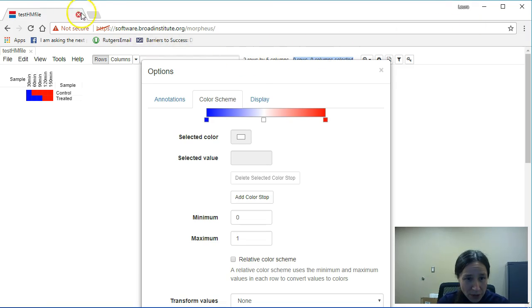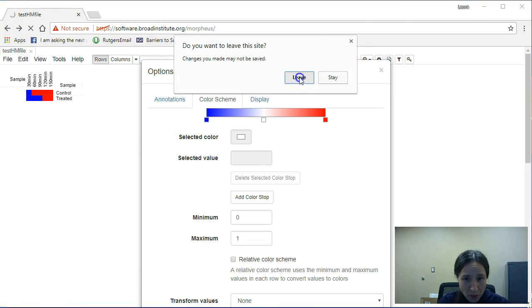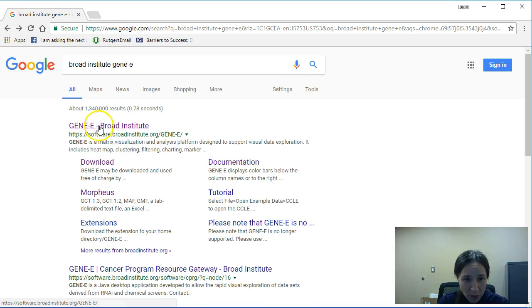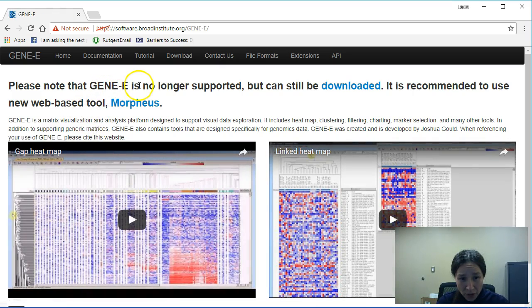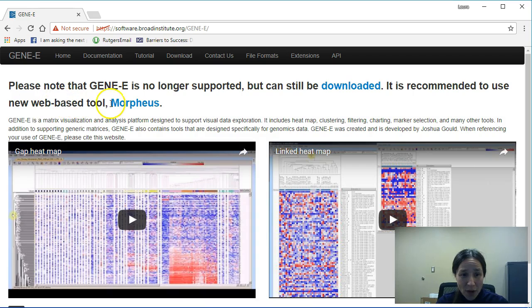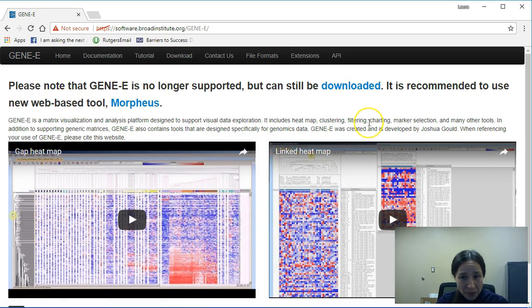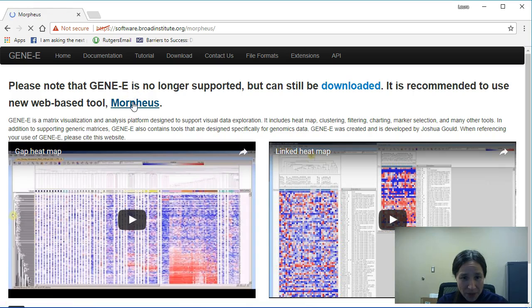So the first thing we need to do is go over to the Broad Institute. Now you'll notice that they no longer support Gene E, but you can download it and I have it on my desktop. I find it very helpful, but they do have this new web-based tool Morpheus if you don't want to do any downloads, say that you've got space issues. Morpheus is more than happy to help. So we can go ahead and click on that.